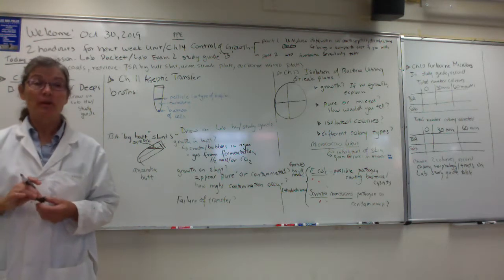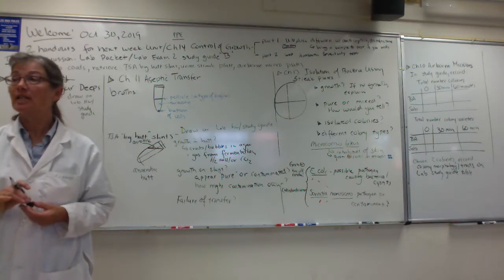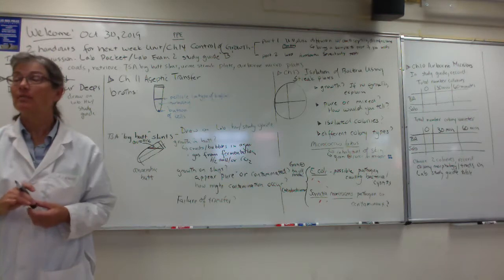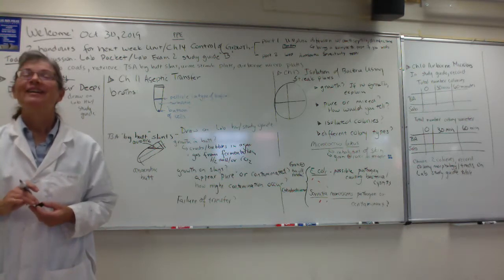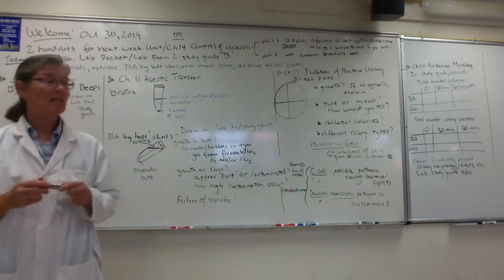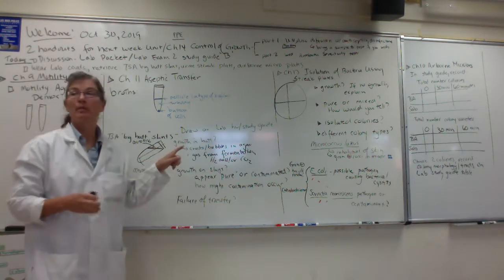Yeah, and it's also evidence that your microbe carries out which process? Fermentation, right, with gas production. What could the gas or gases be? Molecular hydrogen or CO2. Awesome, you guys. And we'll see later when we do some of our metabolic tests.